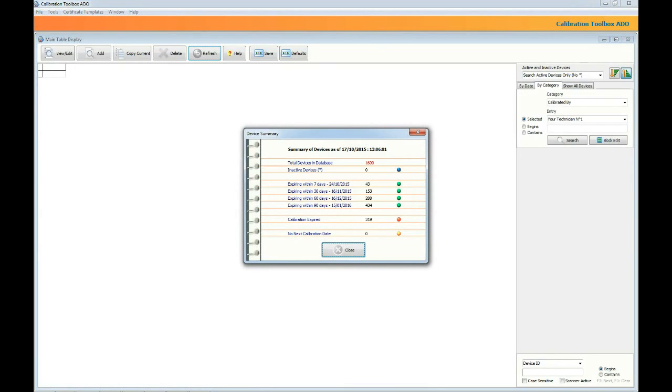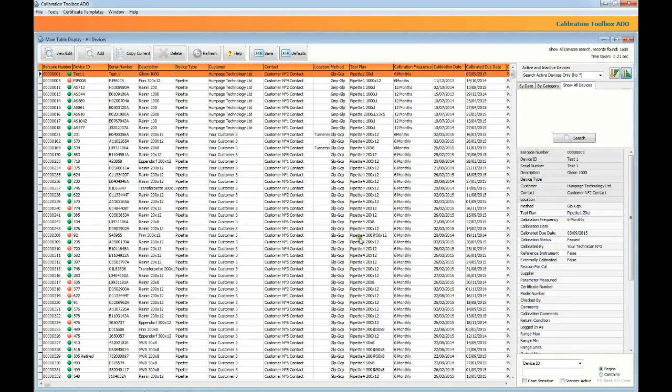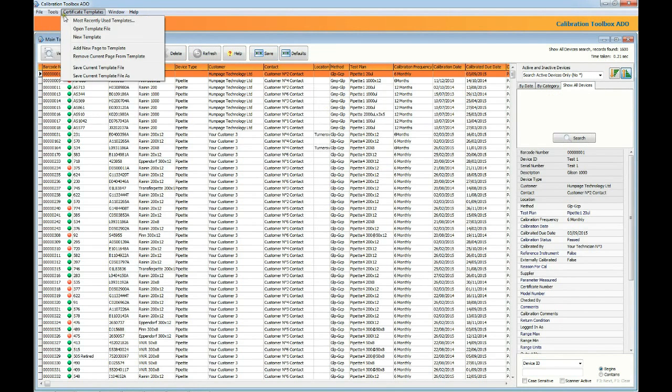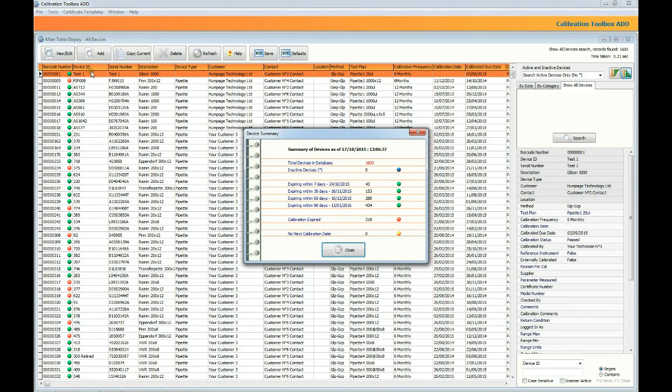The first thing you're going to see is the device summary screen which will show you how many devices there are in the database, how many of those are inactive, how many will require calibration within a certain range of days, those whose calibration dates have expired, and finally those whose entries don't have a next calibration due date. Once you've taken all that in you can close the window down. You can return to it anytime by going to the main tools menu and clicking the first item on the list which is the summary screen.